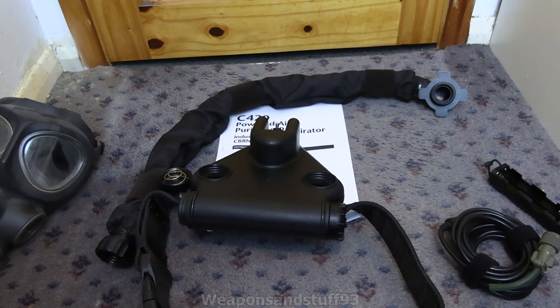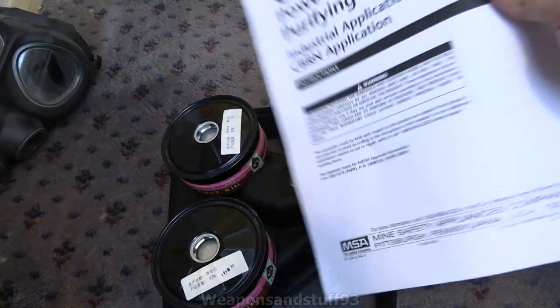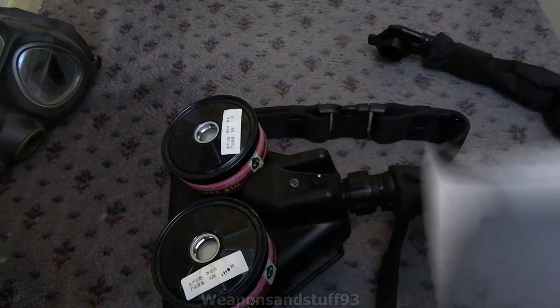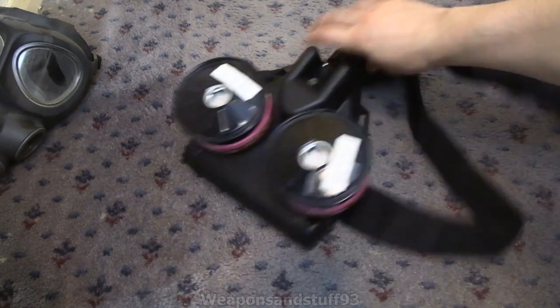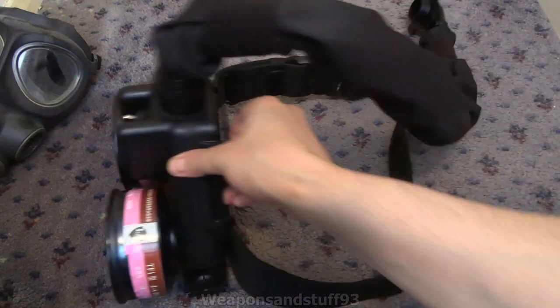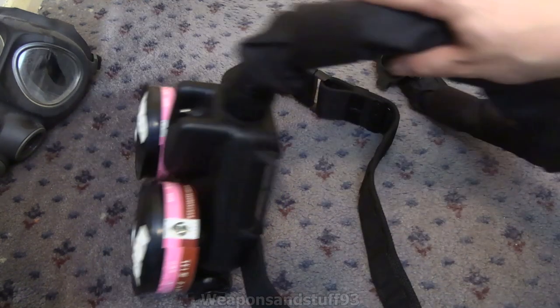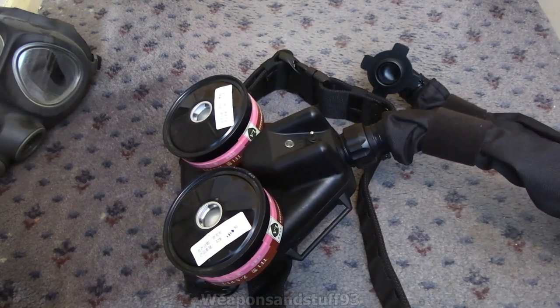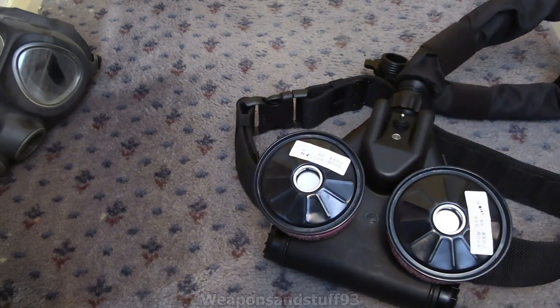So let me assemble it all together using the lithium battery included rather than the battery adapter for this one. That's the C420 assembled. There's a pretty thick, useful instruction booklet included. It looks a bit like a little jet pack type thing. The C420 is pretty damn well built in terms of ergonomics — that's probably the reason the design has caught on so well.